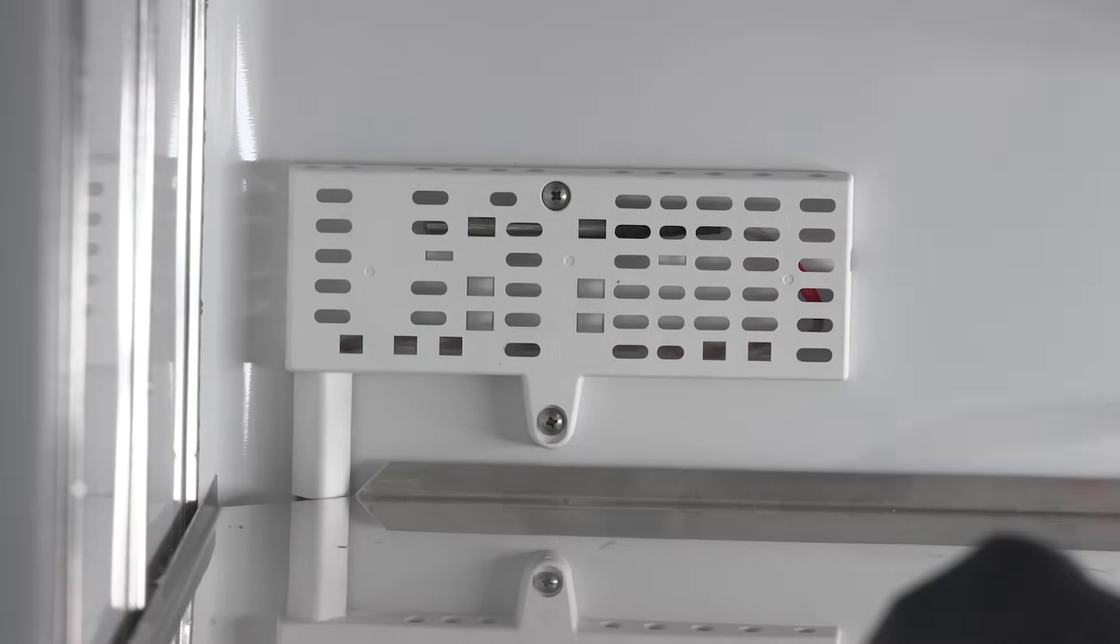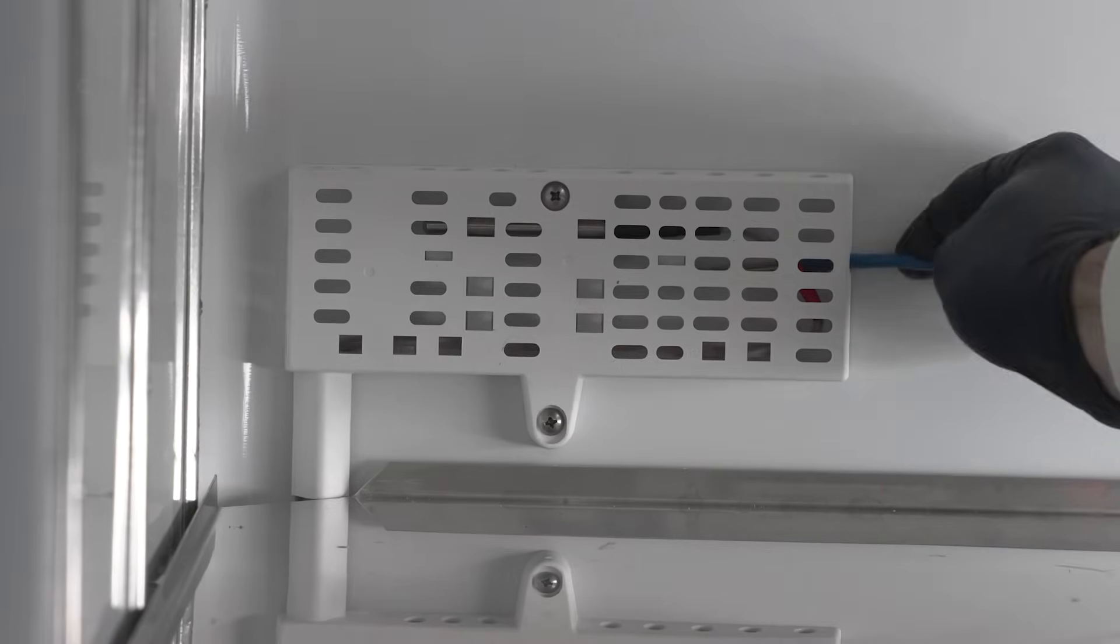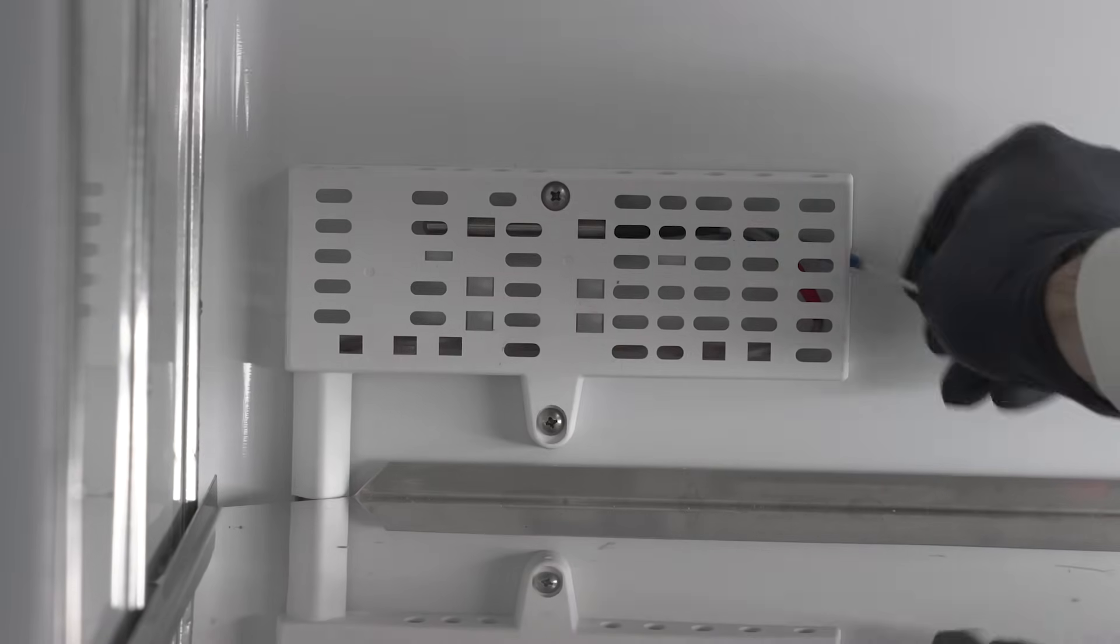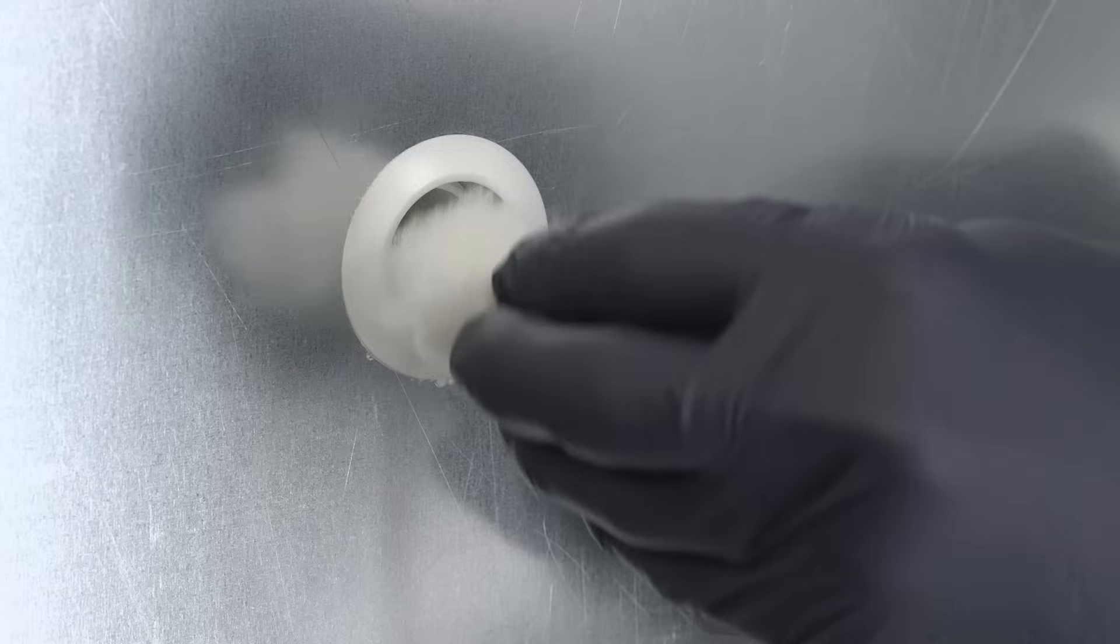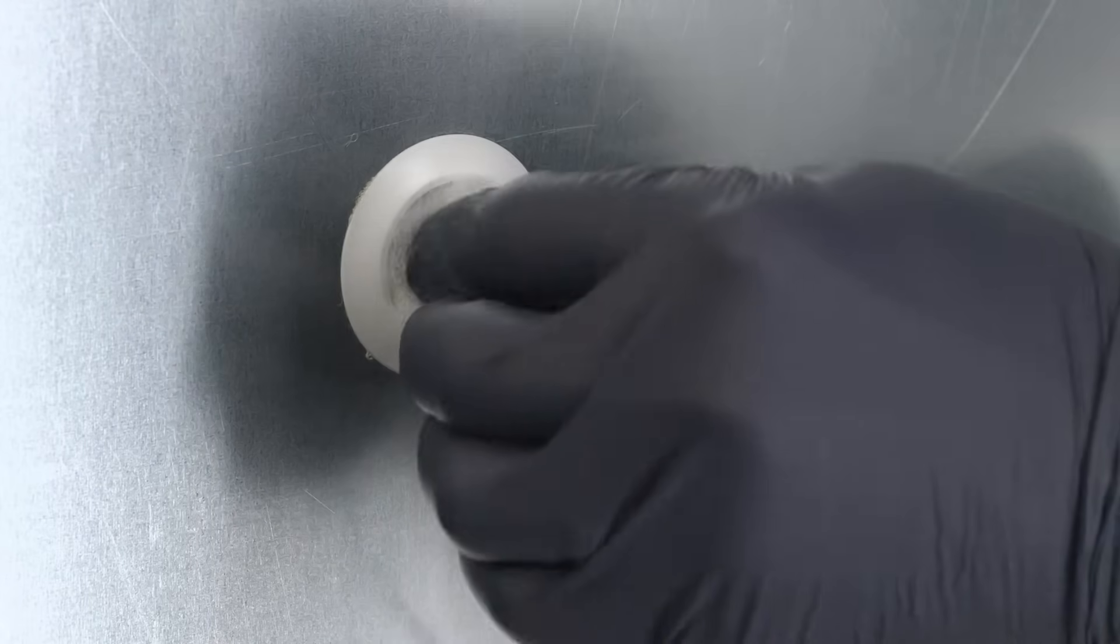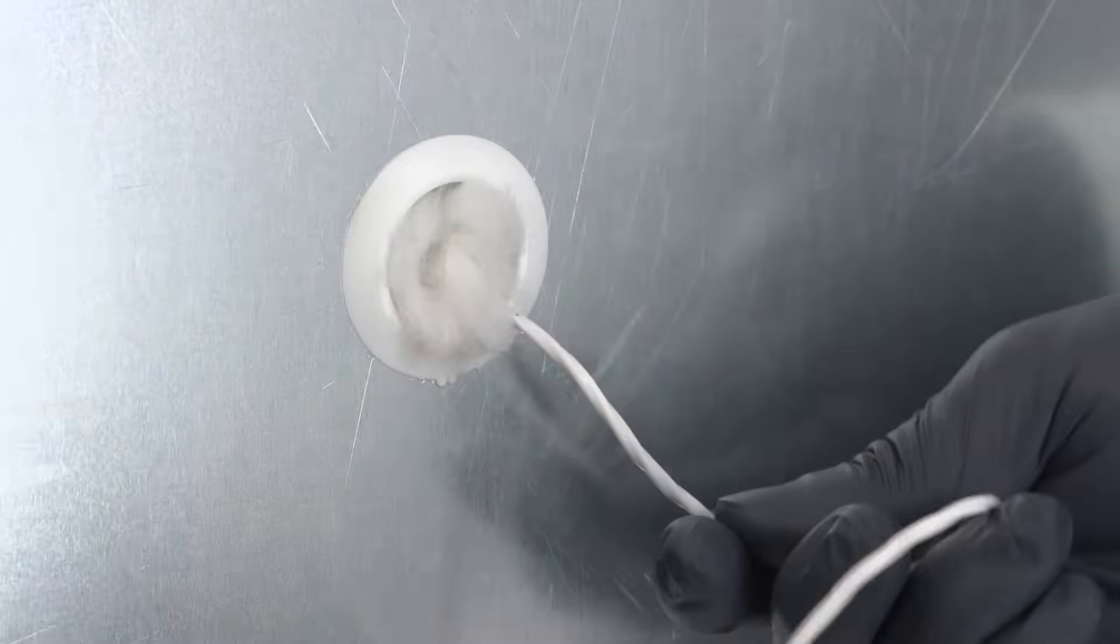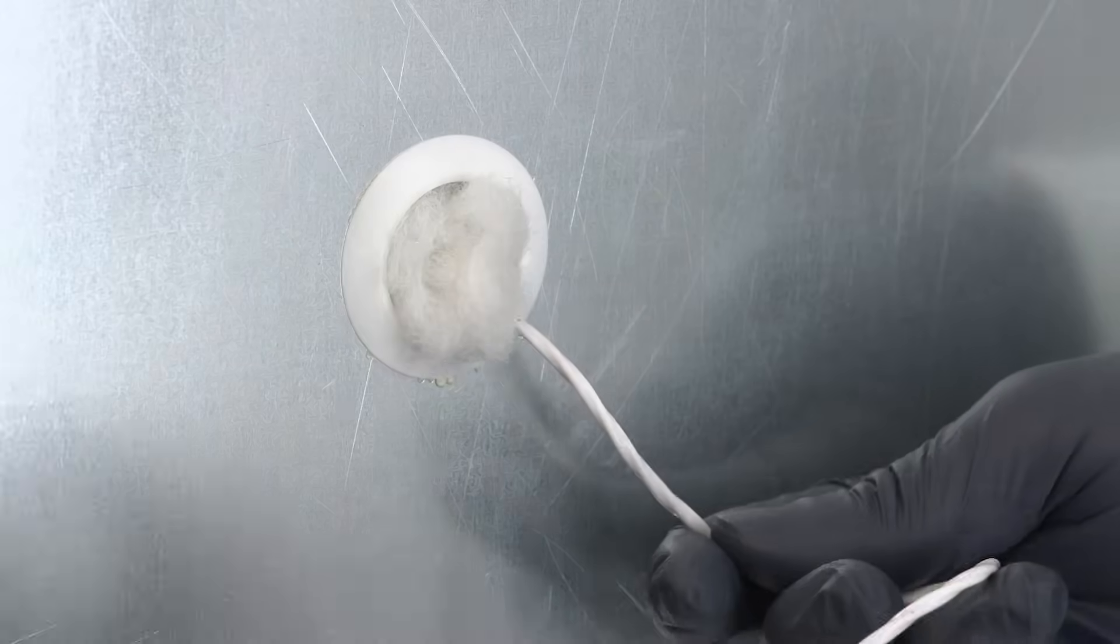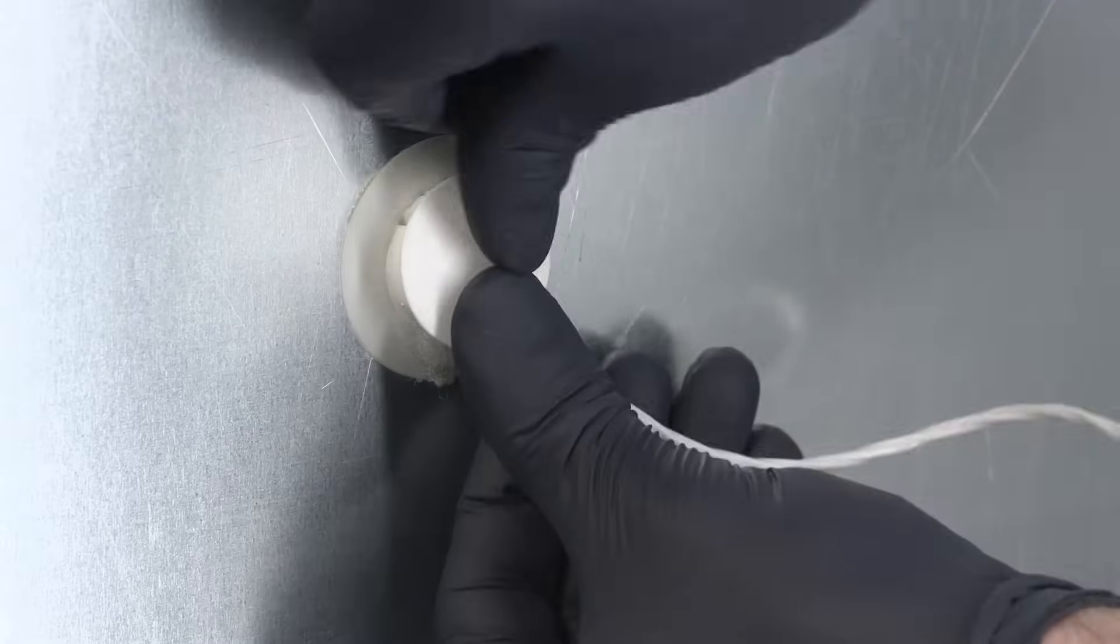In addition to the connectivity power ports on the TSX Universal ULT Freezer, all Thermo Scientific ULT Freezers maintain both dry contact and 4 to 20 milliamp outputs for additional monitoring needs.